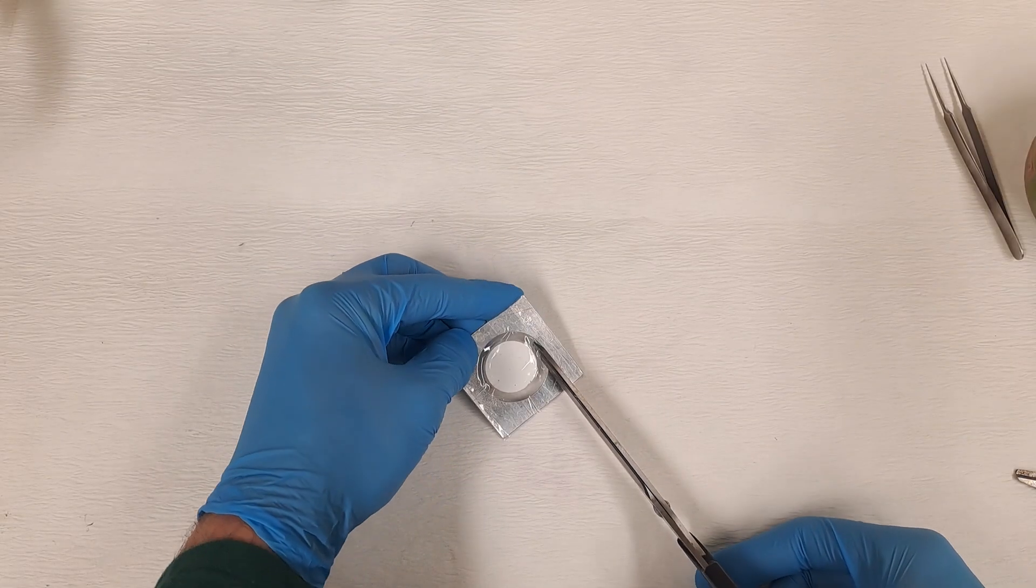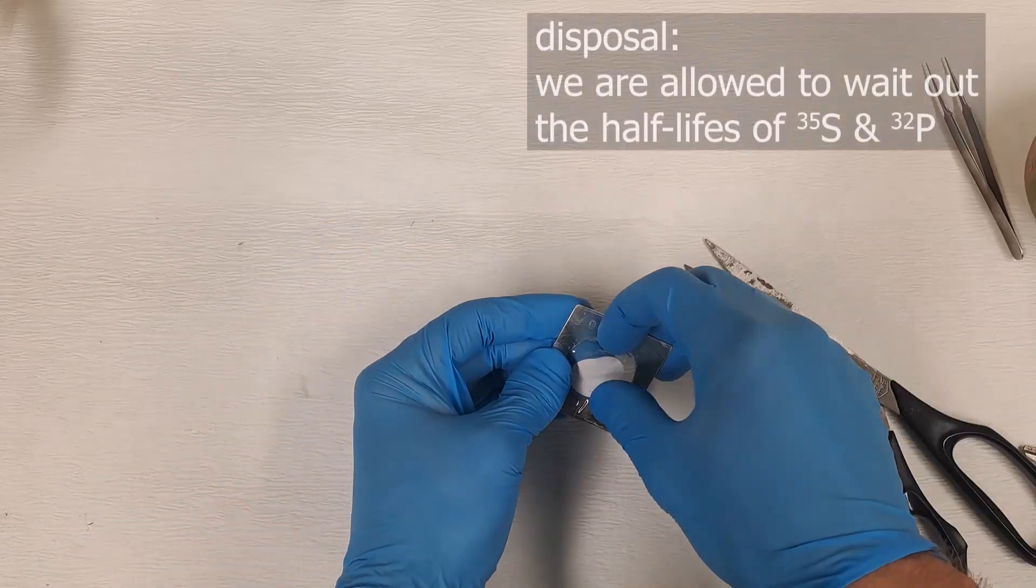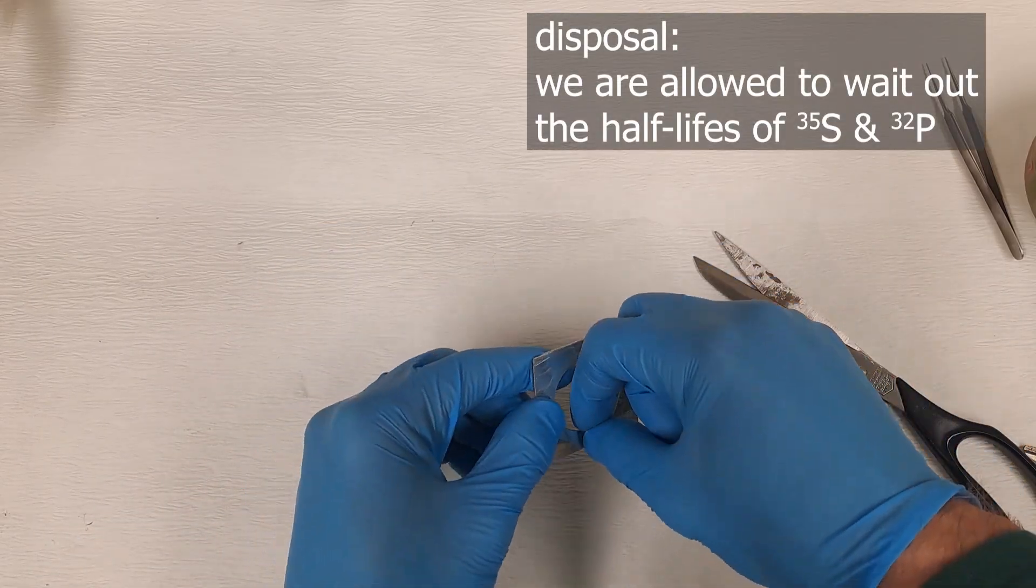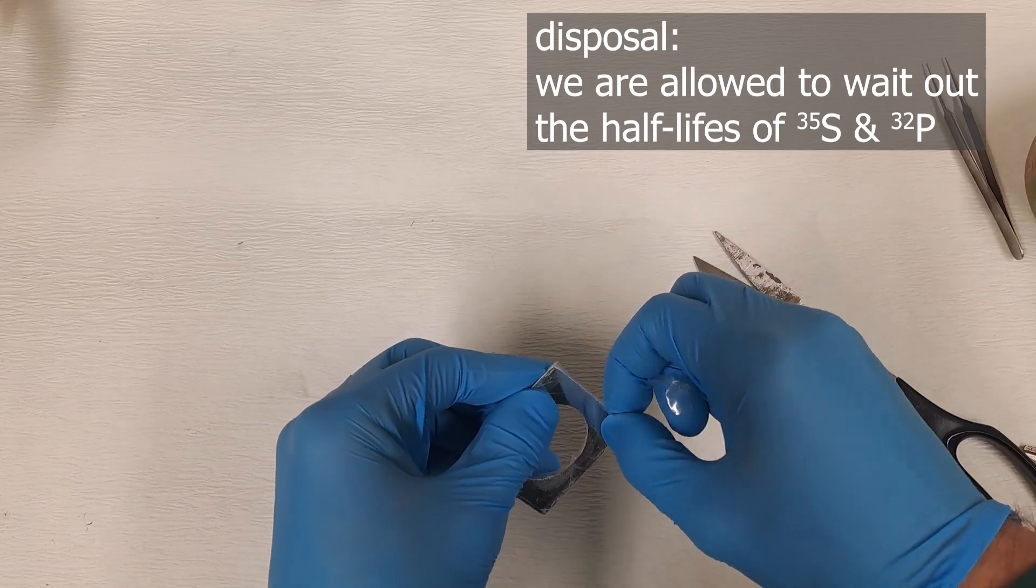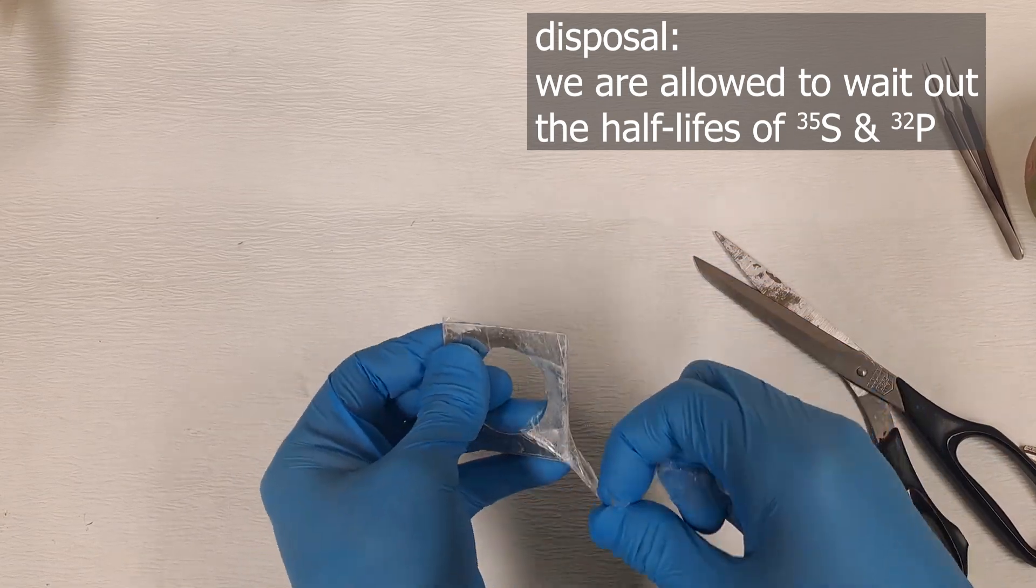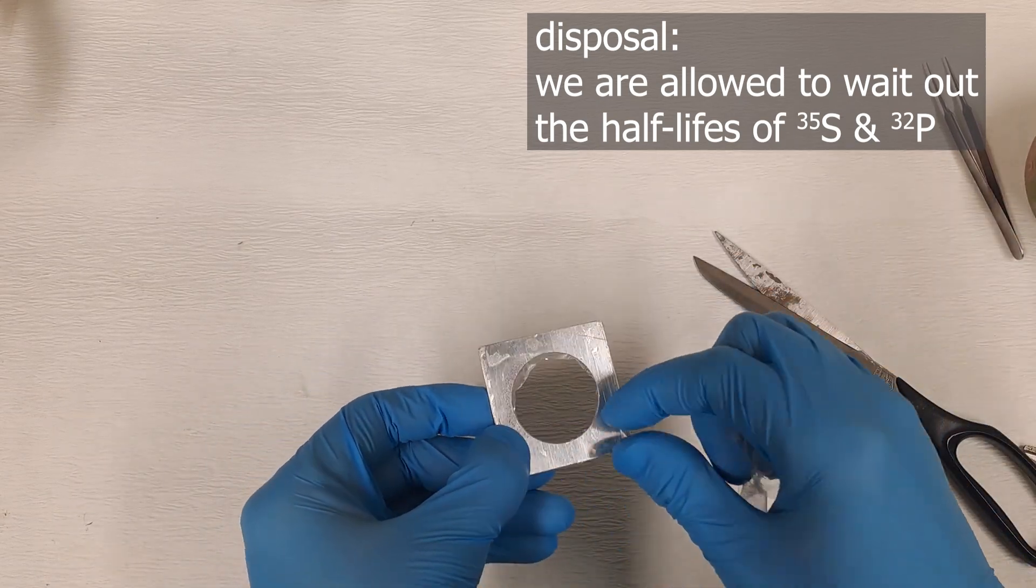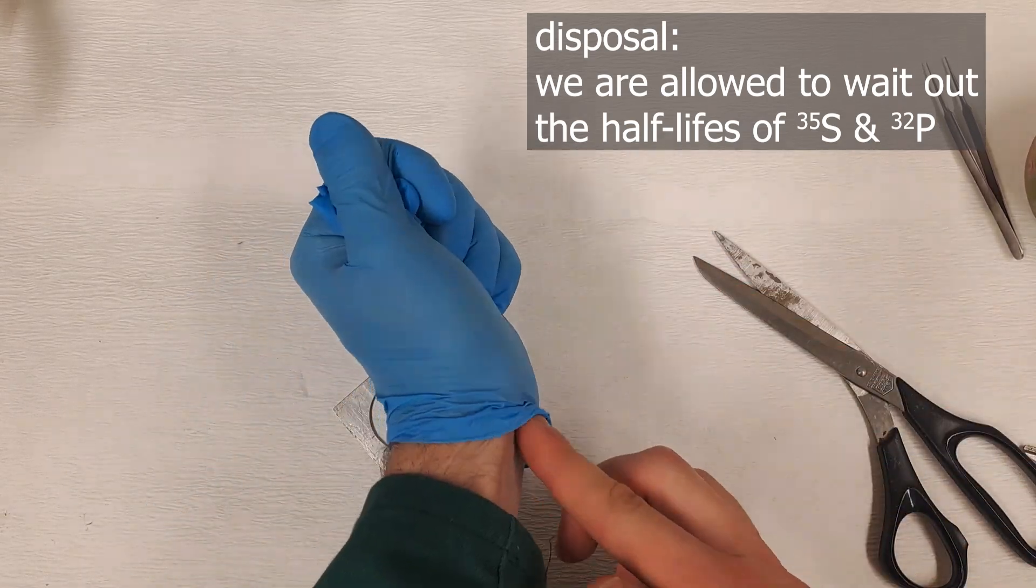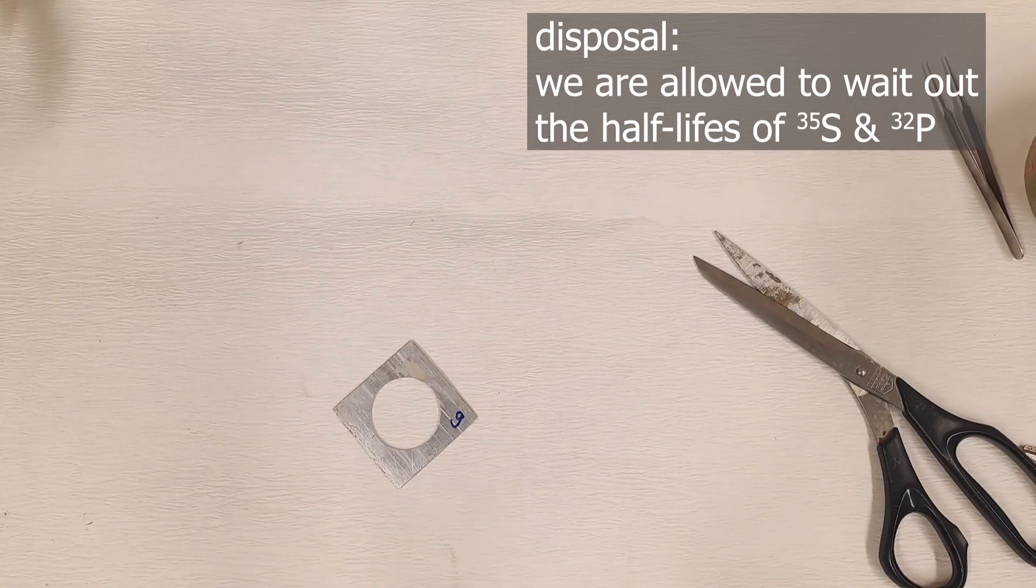Regarding the waste management, fortunately, the disposal is quite straightforward for us because of this 90-day half-life of sulfur-35, meaning we can simply wait it out. We just need to label the container with the date and store it for the next three years and then there will be no remaining activity. We have a license to do that, and also for phosphorus-32.